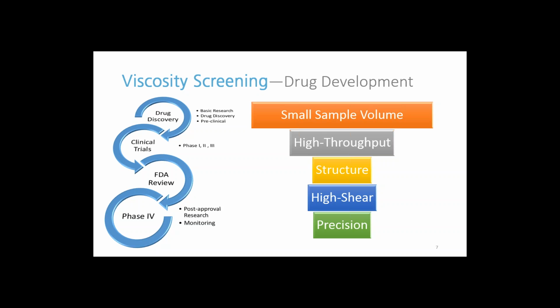So if you think in terms of the early stages, you're going to have a large number of formulations, but you're going to be very limited in the amount of sample that you have. And they are also going to be pretty expensive. So you're going to have requirements such as a small sample volume and high throughput to test your samples.